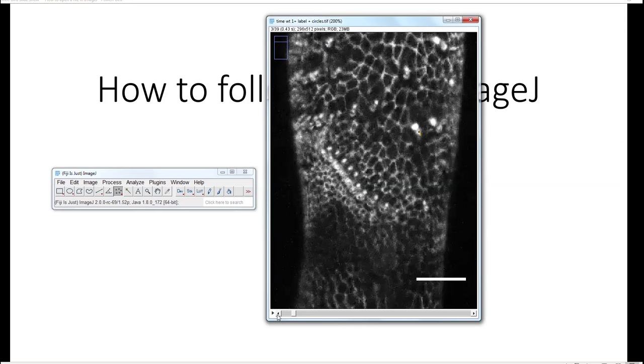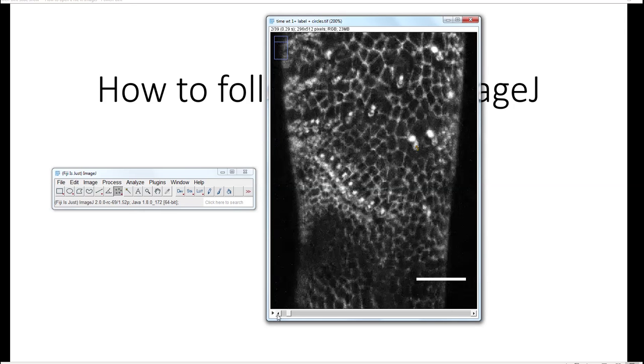I recommend that you start doing it in packages, measuring every 10 slides. Why only 10 slides? Because in case your computer crashes, or in case you make a mistake, if you have 10, you don't waste 10 or 15 minutes doing measurements that you have to repeat. If you do 10, you can make sure where you start, where you finish, and save it.